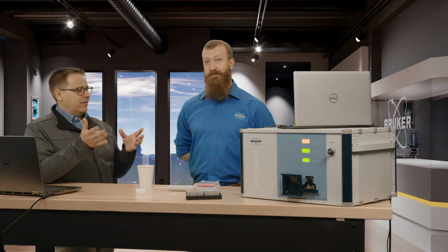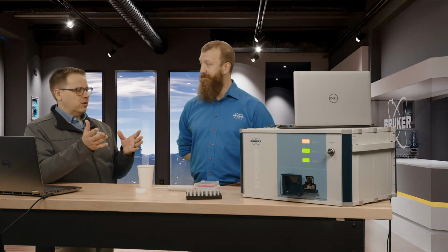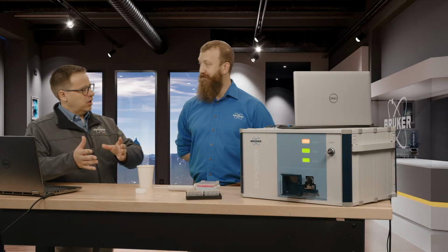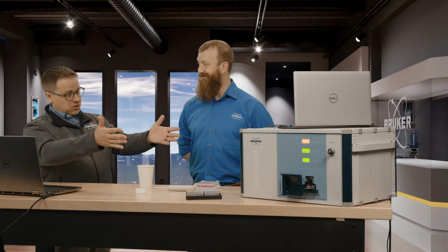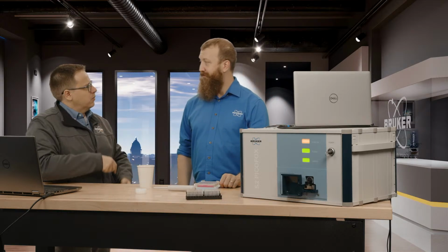Let's talk about how this, though, compares to the other XRF techniques. I mean, because we just talked about tools like a Puma and a Jaguar. These are the benchtop machines too. But the samples, I know, they look quite different. They're typically kind of bulk more.